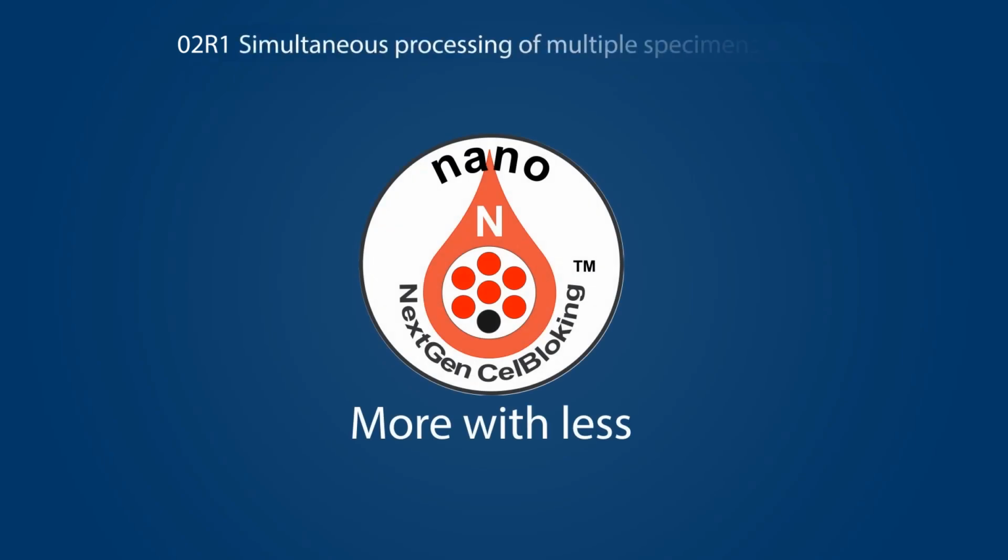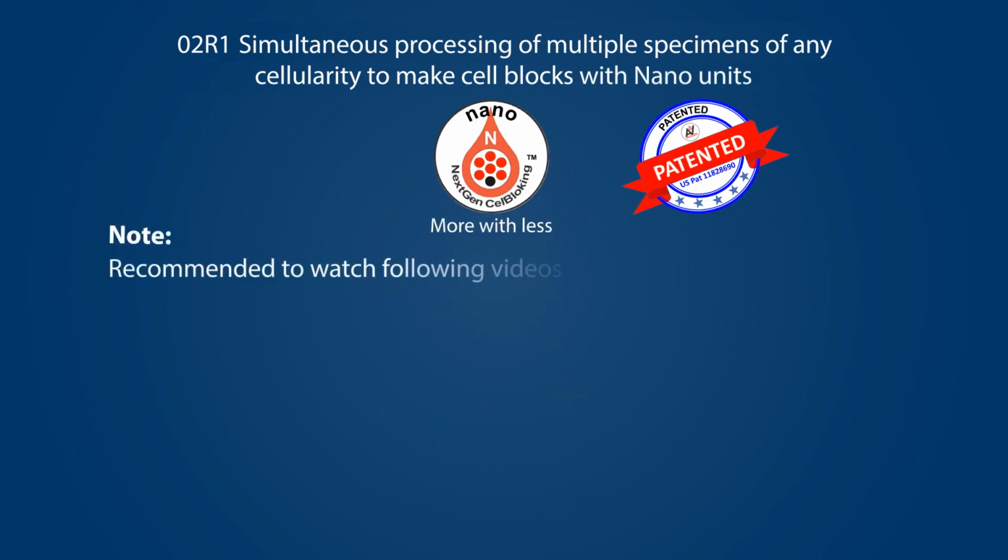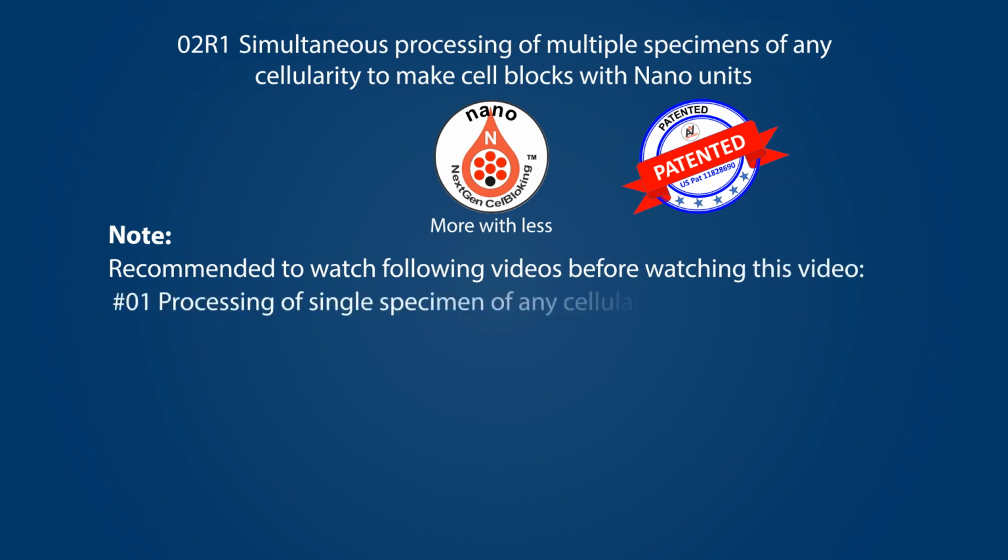Simultaneous processing of multiple specimens of any cellularity, to make cell blocks with nano units. Notes: it is recommended to watch the following videos before watching this video. Processing of a single specimen of any cellularity, to make a cell block with a nano unit.